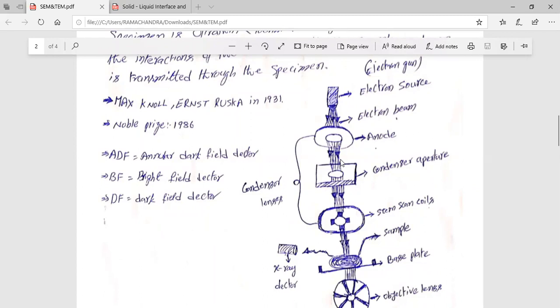Then the lighter molecules easily enter into the other regions. So that's why it is called a condenser aperture. The condenser aperture is nothing but condensing the electrons into a single point. Okay, is it clear, Nana?